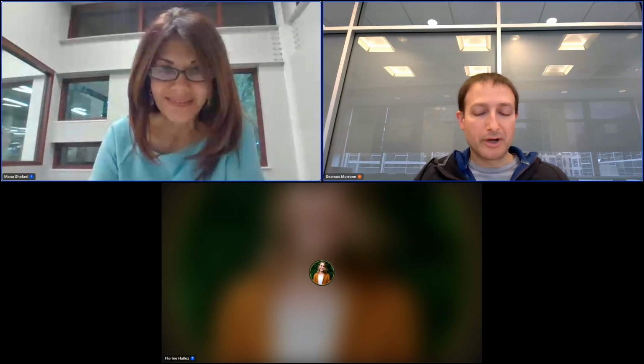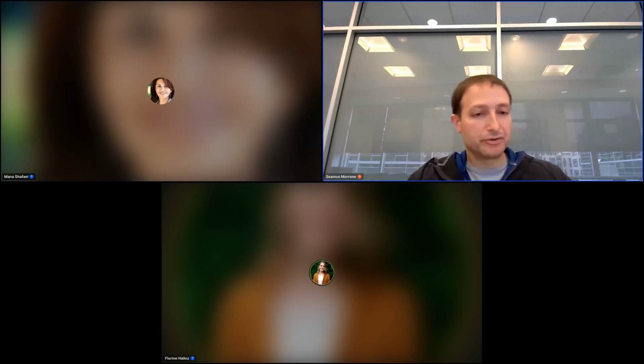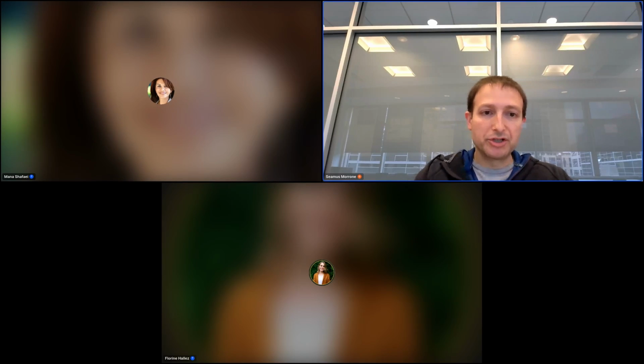Okay, so I'm Seamus Morrone. I'm going to talk today about some phosphoproteomics work we've been doing in the Moritz lab regarding sample preparation and instrumentation on LCMS, specifically on Orbitrap for DDA.